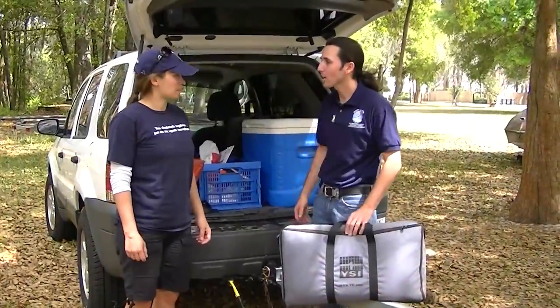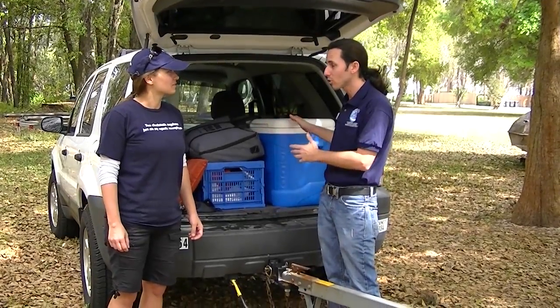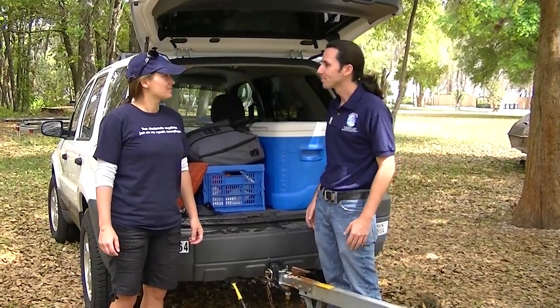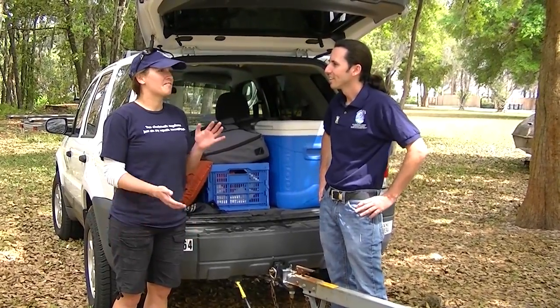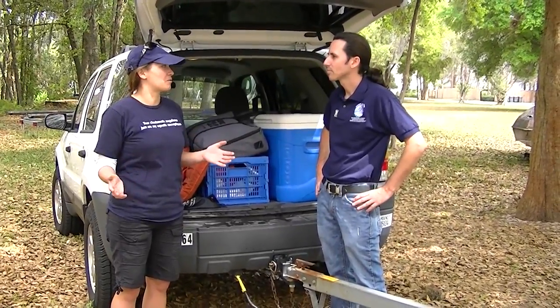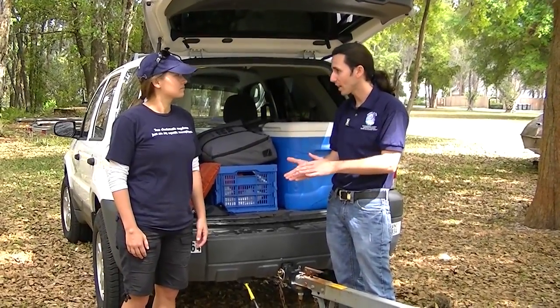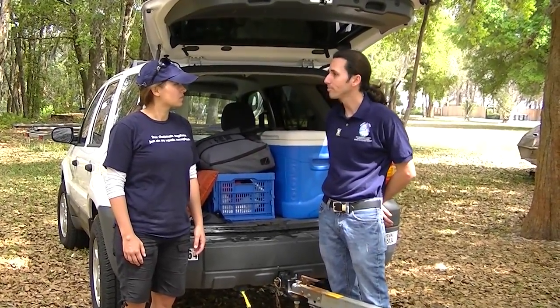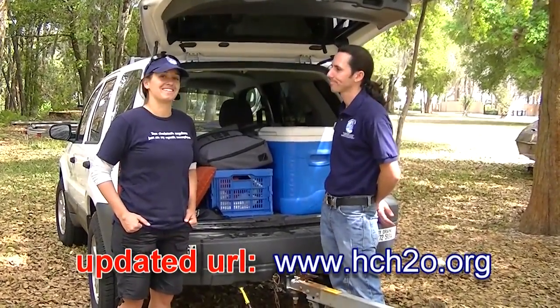So we just got done with our sampling, and now we're going to get our samples back to the lab. At home, put them in the freezer — take them straight back, get them out of your cooler, and put them in the freezer until you can get them to our collection center. If you forget anything while sampling, you get some manuals when you were trained — make sure you keep those handy. There's a waterproof reference card you can take with you, and you can always look things up online or give us a call. The website is hillsborough.wateratlas.org.